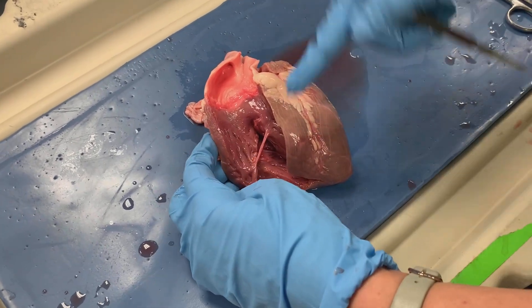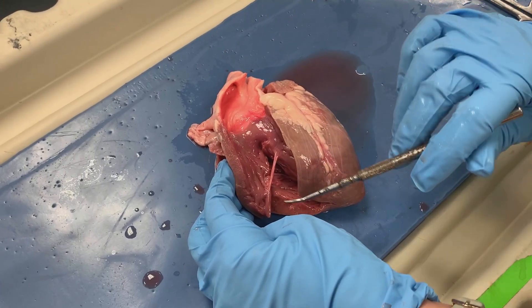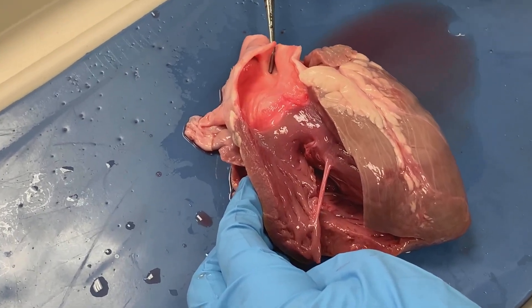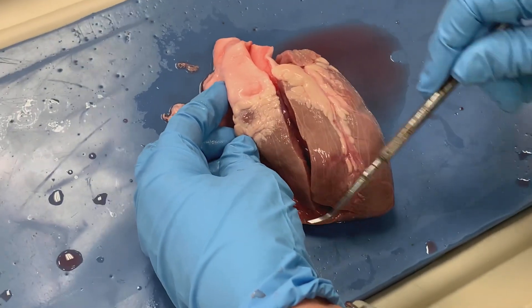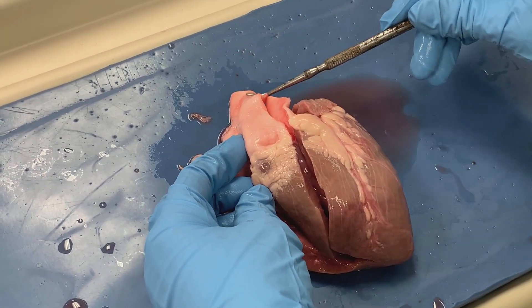We have now made our second cut through the heart. This cut extended from the right ventricle and moved superiorly through our pulmonary trunk. Let me show you what it looked like intact for perspective. So we can see right ventricle here and we can see pulmonary trunk.